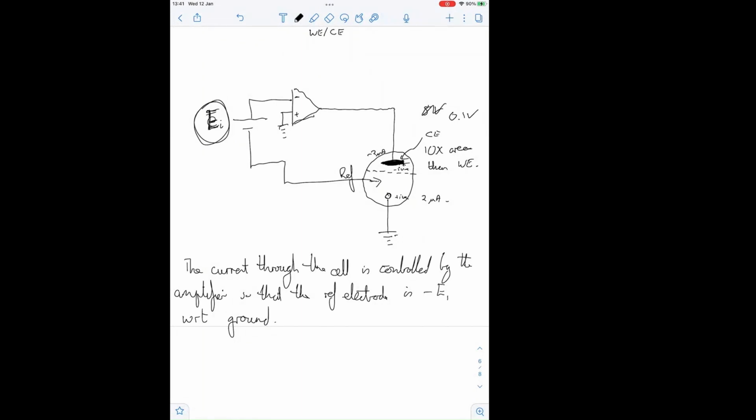I said, yeah, scan the potential between 0 volts and 0.1 volts. The manual says that I can go between 0 volts and 2 volts. So I've gone 0 volts to 0.1 volts. That's a lot less than the range, and it's saying voltage overload. That's not possible, so I'm just ignoring it.